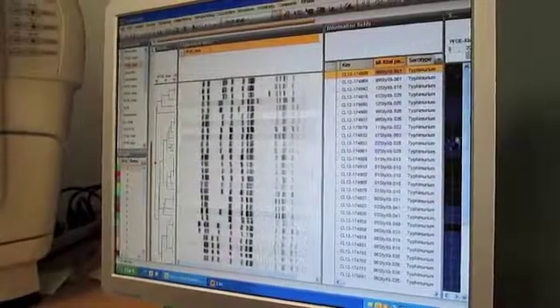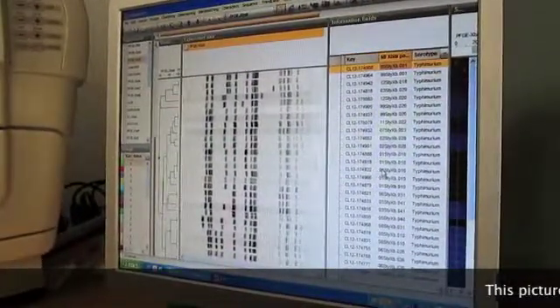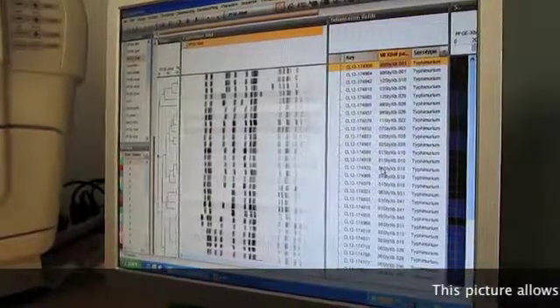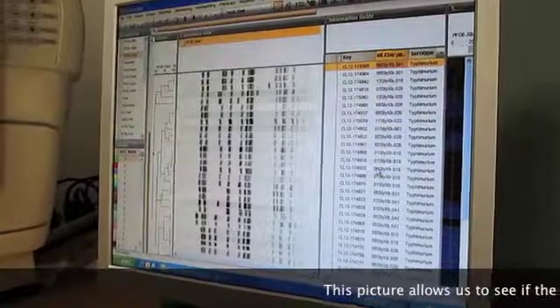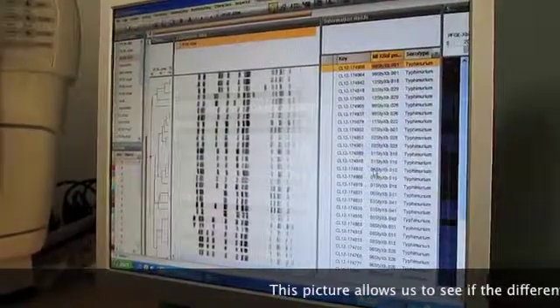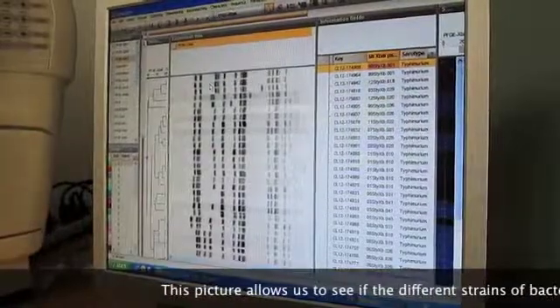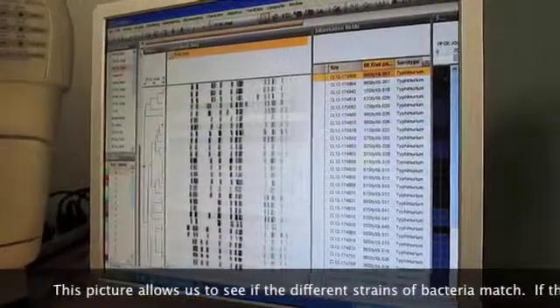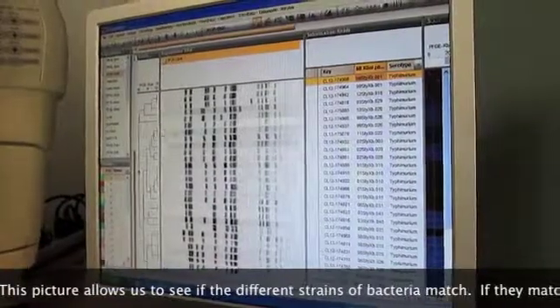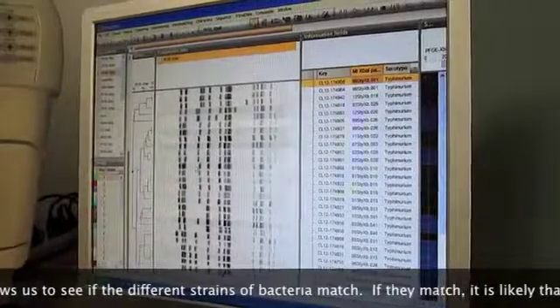Looking at all the patterns, there are 31 patterns in this window. The software has compared each of those 31 patterns to each other and displayed them in a dendrogram showing matching and similarities. At the top of the window, there are two patterns that are identical, different from the next two patterns. There are other matches in here — a pair of matches here, and a group of patterns here that match.